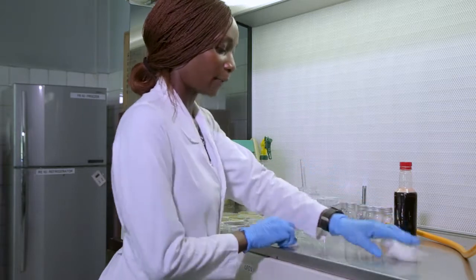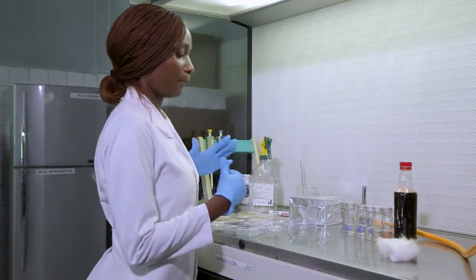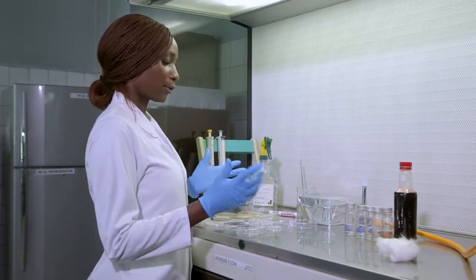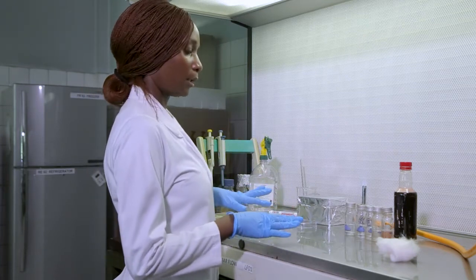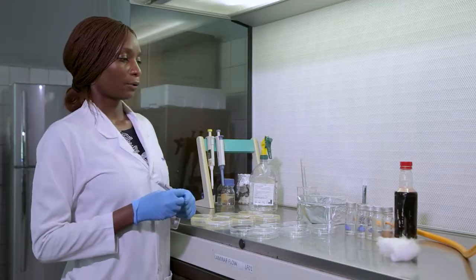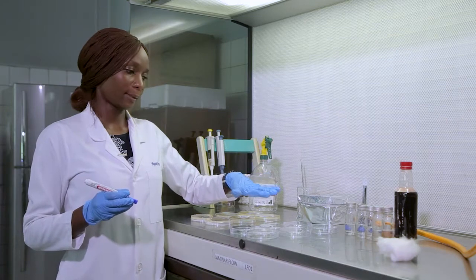Okay, so after having done that, I am going to choose any 3 dilutions that I'm going to plate. I could decide to plate all these, but it will require so many petri dishes and a lot of media. So I'm going to choose any 3 dilutions and plate them in duplicates. After having finished the serial dilutions, now I'm going to demonstrate the pour plate technique.